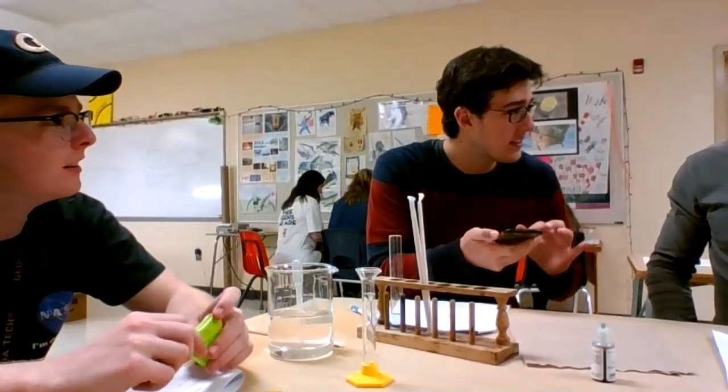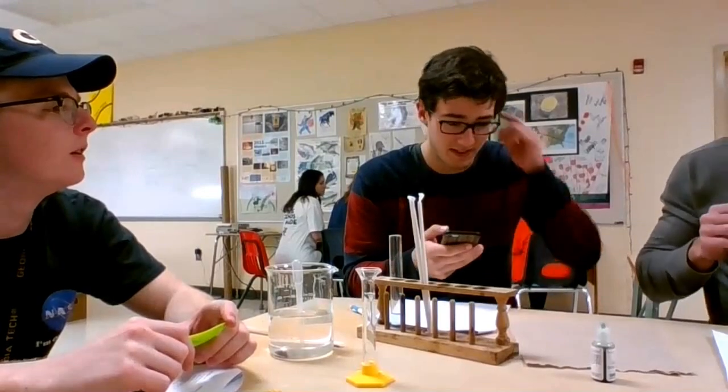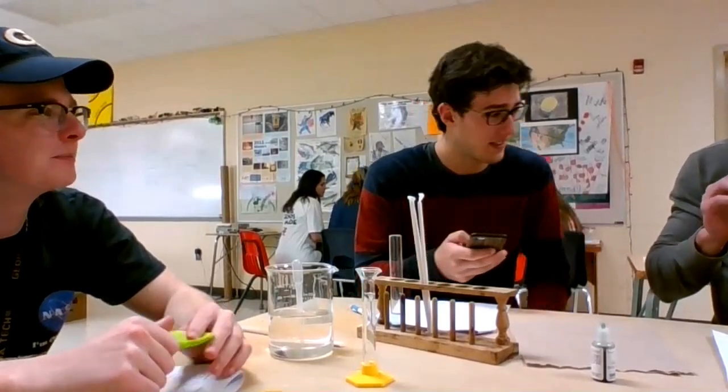Are you blowing? You gotta make it bubble in each of the beakers. Hold on, let me start. Put it all the way in there. You gotta blow really hard for that. Dissolve.